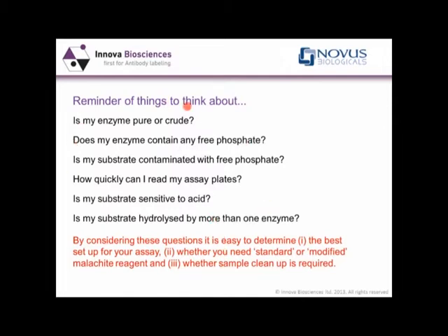So if you think about these things, it's fairly easy to get the best setup for your assay. Easy to determine whether you need a standard or modified Malachite reagent, and whether any sample cleanup is required.